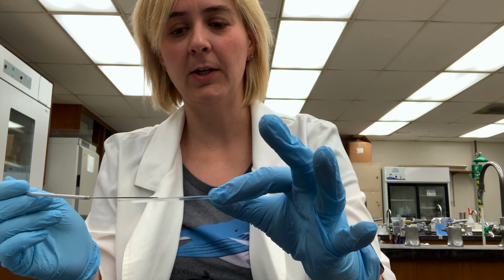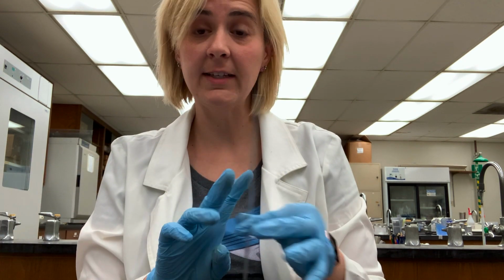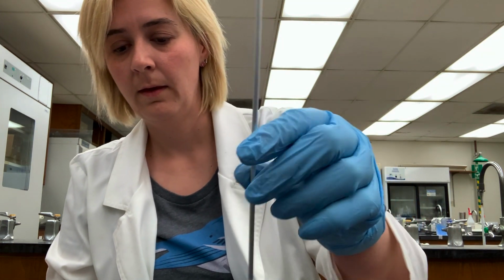Spread it out as much as possible so it'll air dry pretty quickly. I'm going to re-sterilize my loop. Okay. And while this is air drying, I'm going to grab my stain.